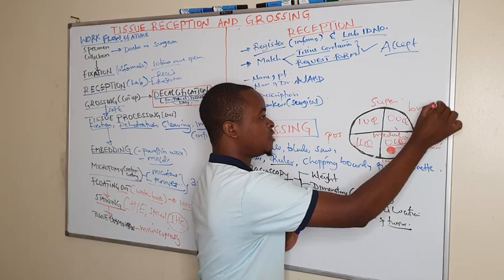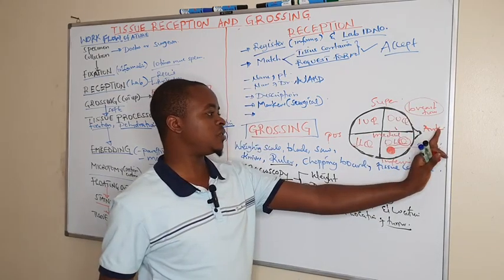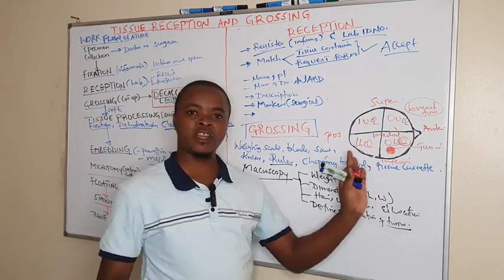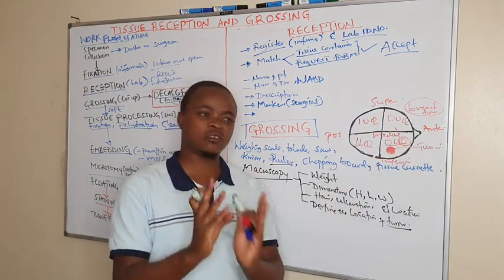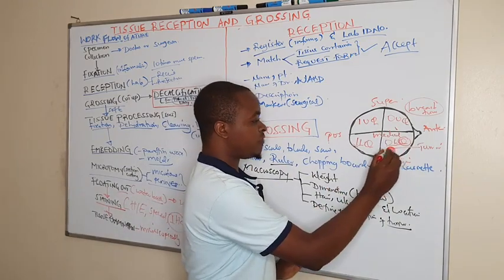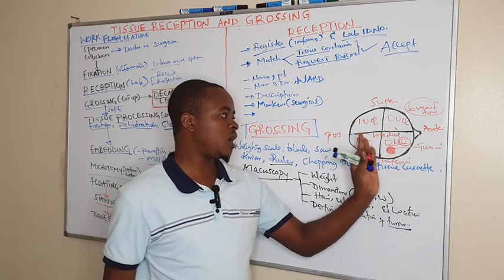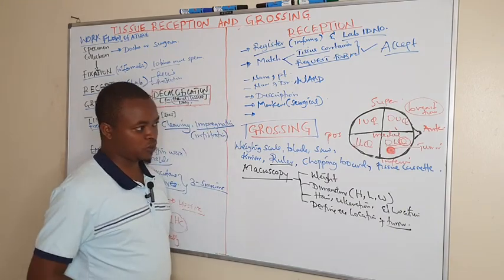If it is a breast tissue, we are using that example, whereby you define the location: the anterior position, the posterior, the superior, and the inferior. Then you go ahead to make the quadrants to define which position the tumor is located. And we find the tumor is located on the outer lower quadrant. You also report it under the description.